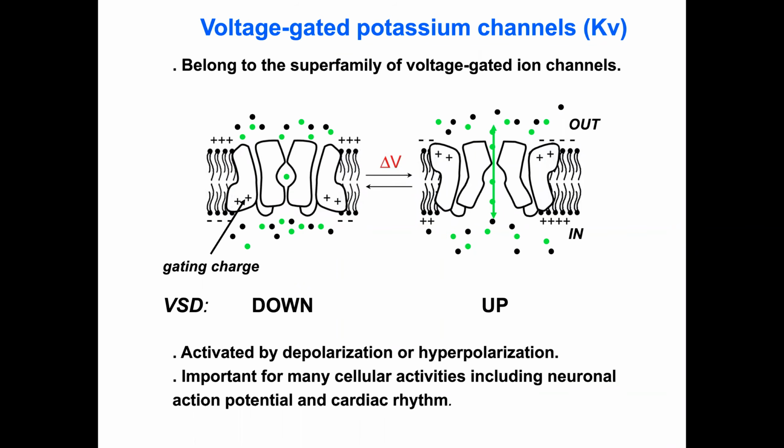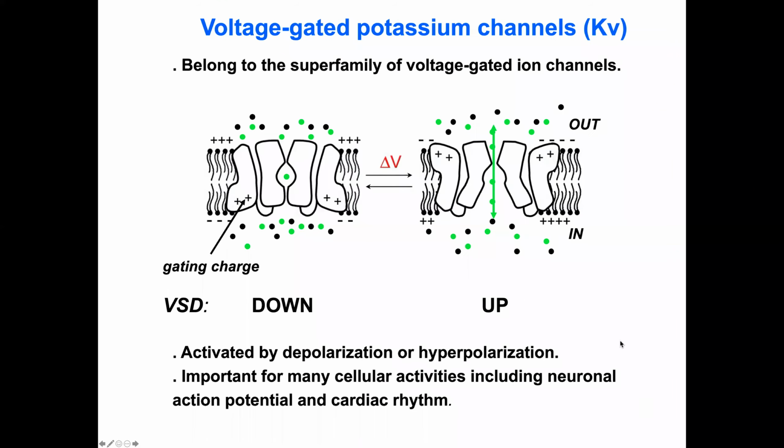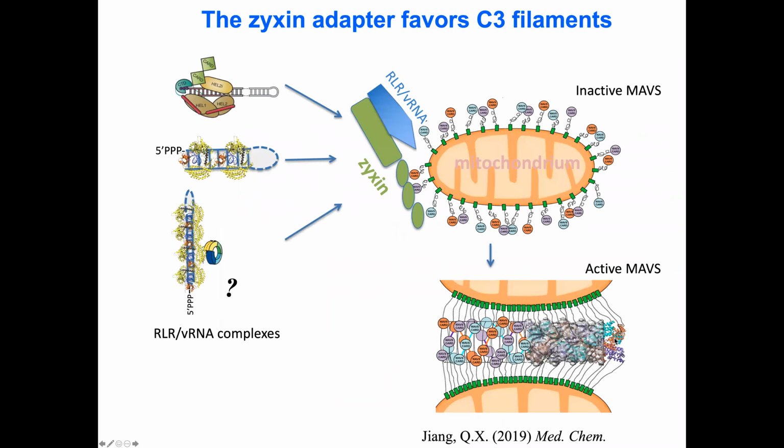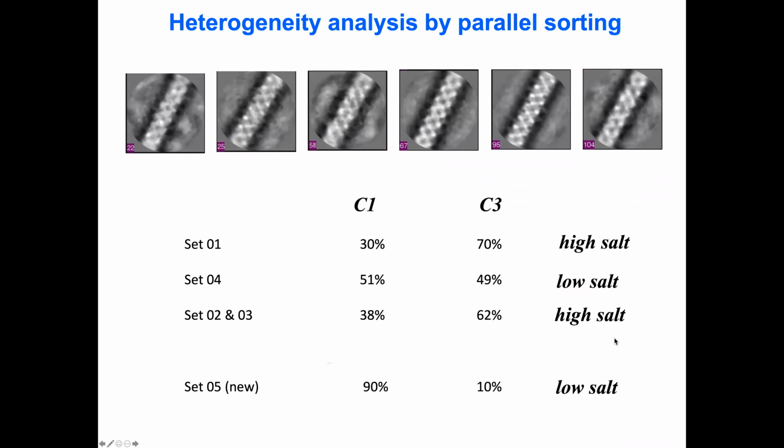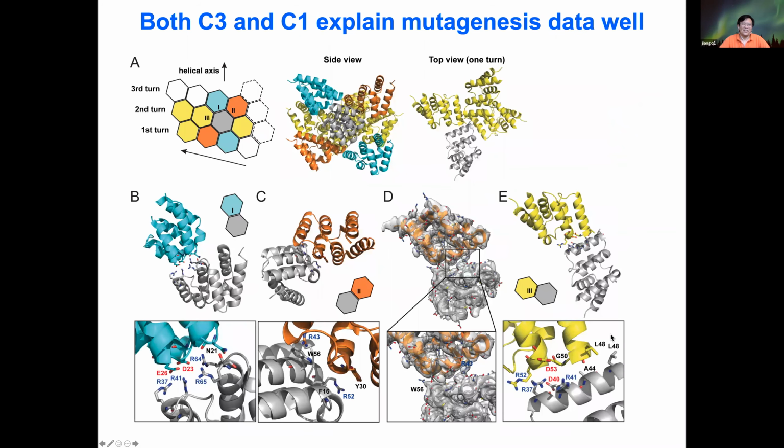Thank you. I just wanted to know that. Hi, I have one question. It's regarding the nickel NTA coated grid using the new method. In that case, all your molecules will be in a kind of similar orientation.